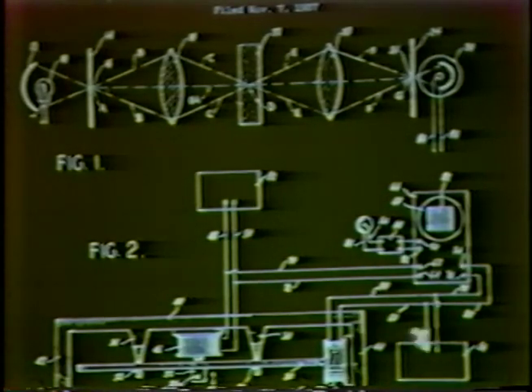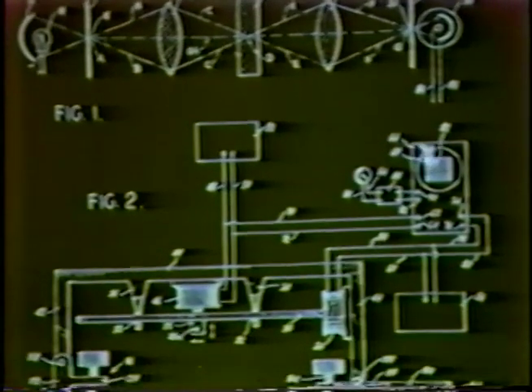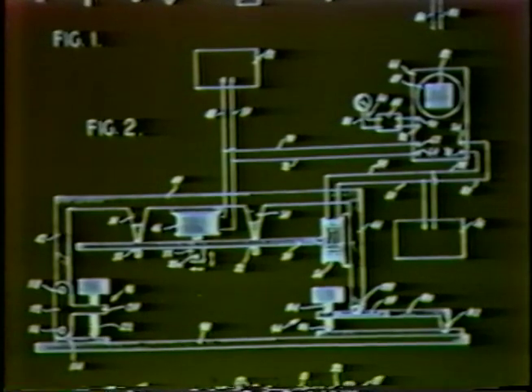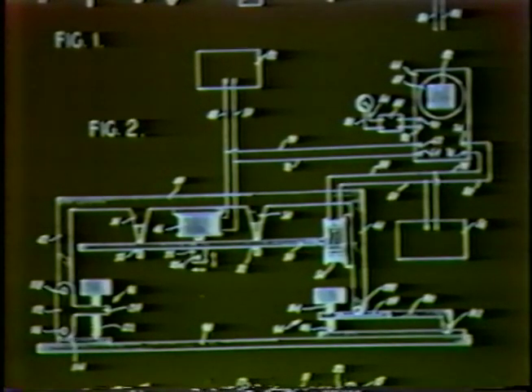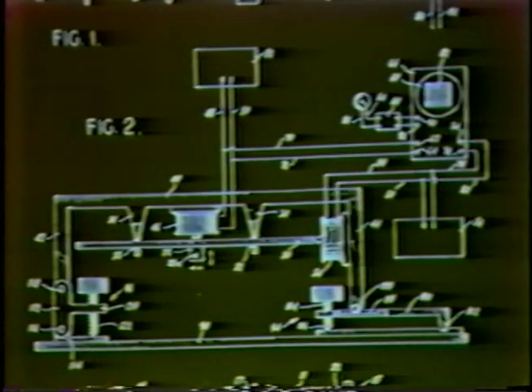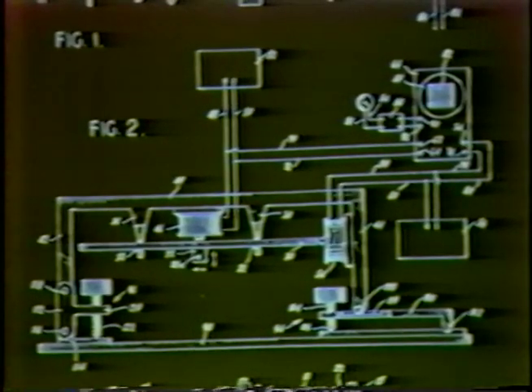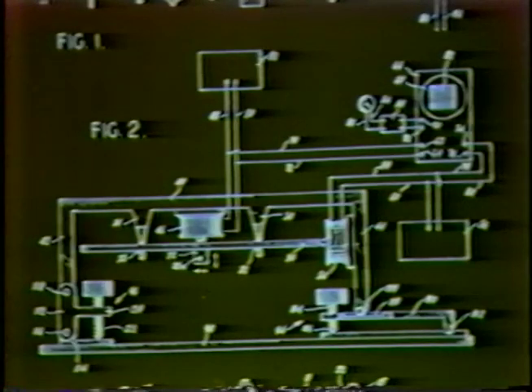And the many other microscopes which have been built on the mechanical movement principle have achieved frame speeds of about that value. And I'm afraid to say that, of course, that's the reason why they haven't taken on in many fields, because it is, in fact, painfully long to wait for one frame in every 10 seconds when the one frame only represents one of the many focal planes that you want to look at. You can accept one frame every 10 seconds in a scanning electron microscope because everything's in focus. But in a confocal optical microscope, you've got to go through all the many planes in order to find the information that you want. So 10 seconds frame speed is hopelessly slow.